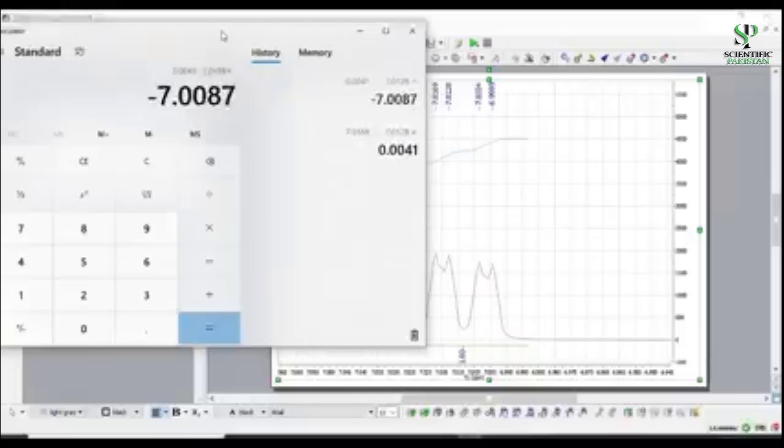Sorry, let me do it again. 7.0169 minus 7.0128 is equal to this, multiplied by 600 is equal to 2.46. So it's an aromatic region. This might be the meta coupling. This bigger doublet, 1 minus 3, should be equal to around 8 hertz.